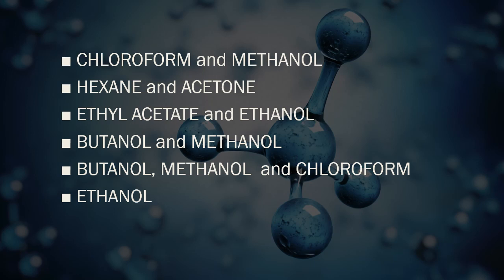To efficiently extract your lipids from a biological tissue, you need a mixture of a polar solvent, to disintegrate the lipids from cell membranes, and a nonpolar solvent, to dissolve the lipids.